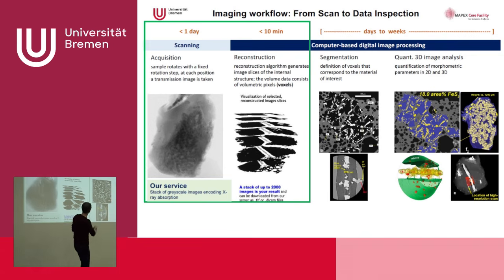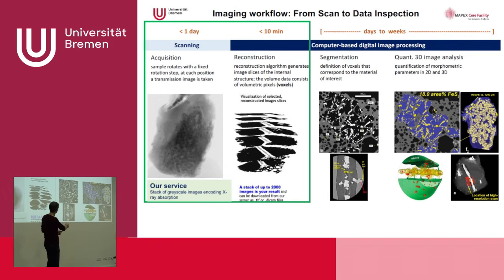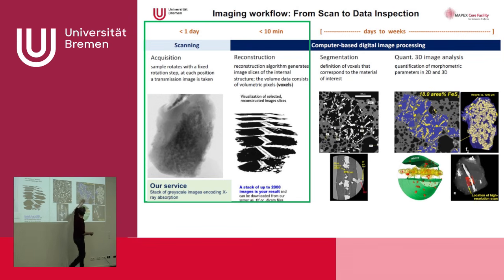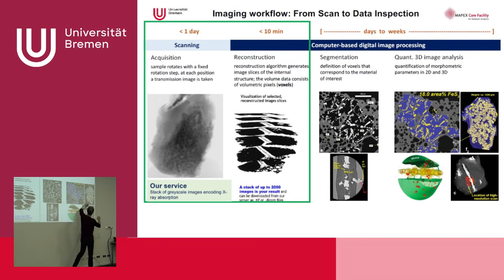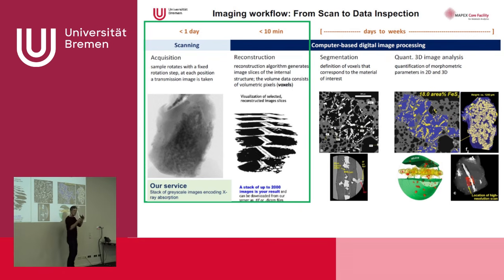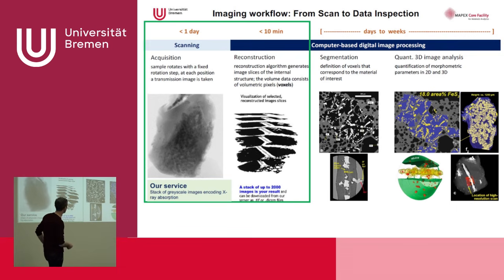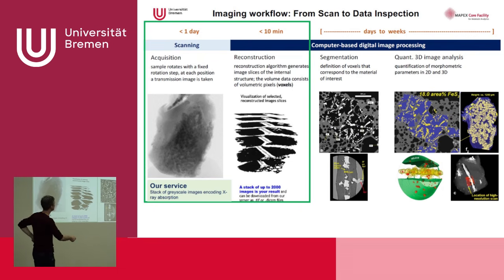And what we do then is something that we call segmentation. We take all these iron sulfide voxels into one 3D model, and then we calculate, for example, the area percent, or in 3D, the volume percent of that kind of filling of iron sulfide in the void, so we can have a volume percentage. Or we could use porosity, something like that. So we can really quantify something of these kind of 3D models from our technique.